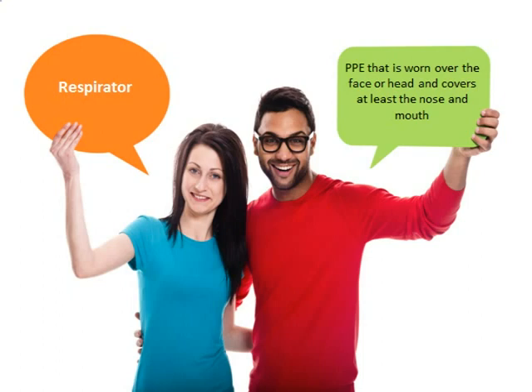Respirators are not ventilators, or those devices that assist sick individuals to breathe when they are unable to breathe on their own. The most important difference between a respirator and a ventilator is that, unlike a ventilator, a respirator does not perform any actual breathing function for its wearer. Instead, the respirator's purpose is to purify inhaled air before it enters the lungs by trapping harmful particles and fumes.